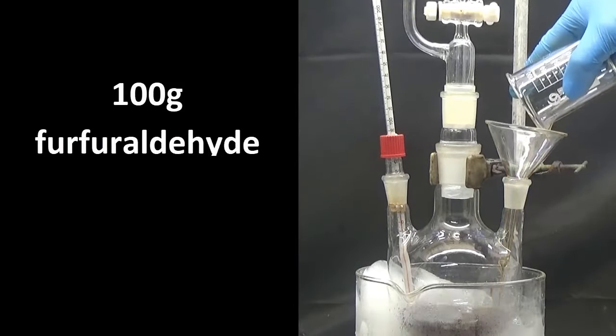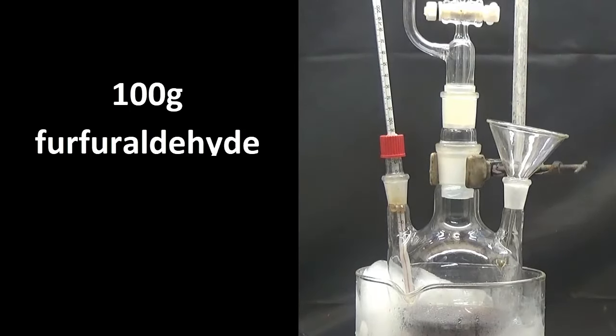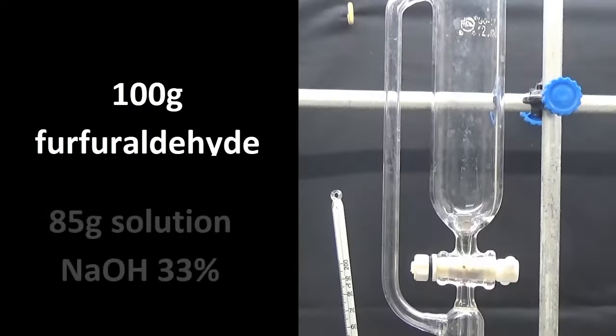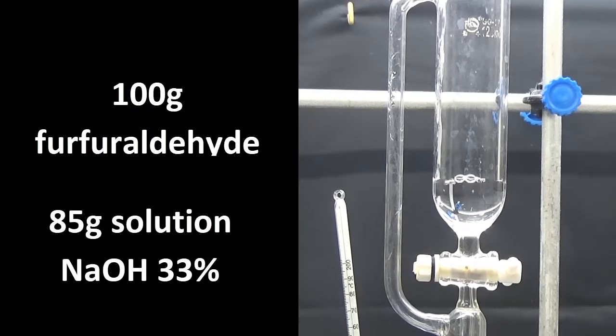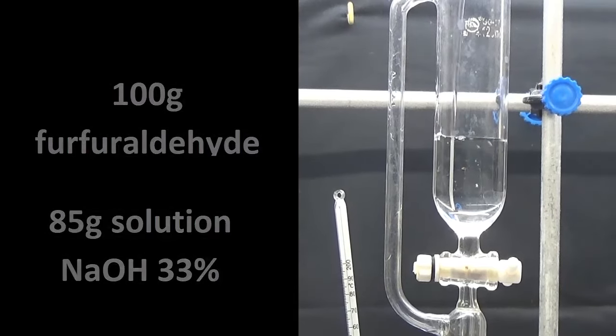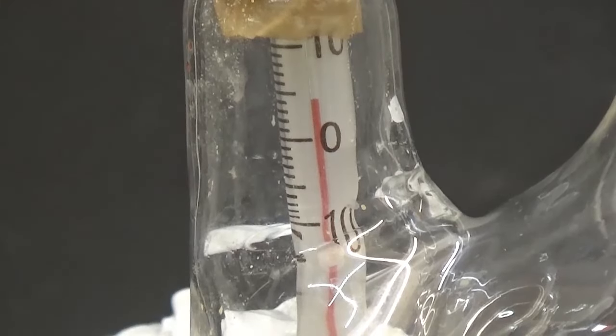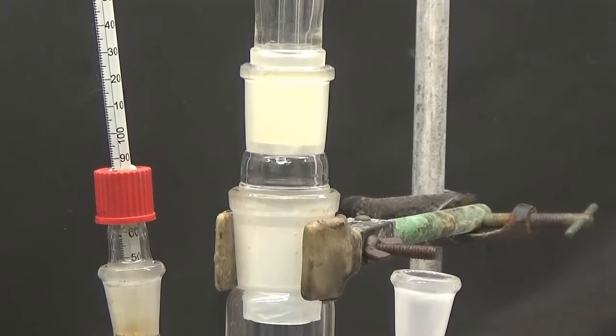In a 500 milliliter flask with an addition funnel, a thermometer and a bath of ice, we put 100 grams of furfuraldehyde in the addition funnel. Put 85 grams of 33 percent sodium hydroxide solution. When furfuraldehyde reaches a temperature below 10°C, slowly add the sodium hydroxide solution without allowing the temperature to exceed 20°C.